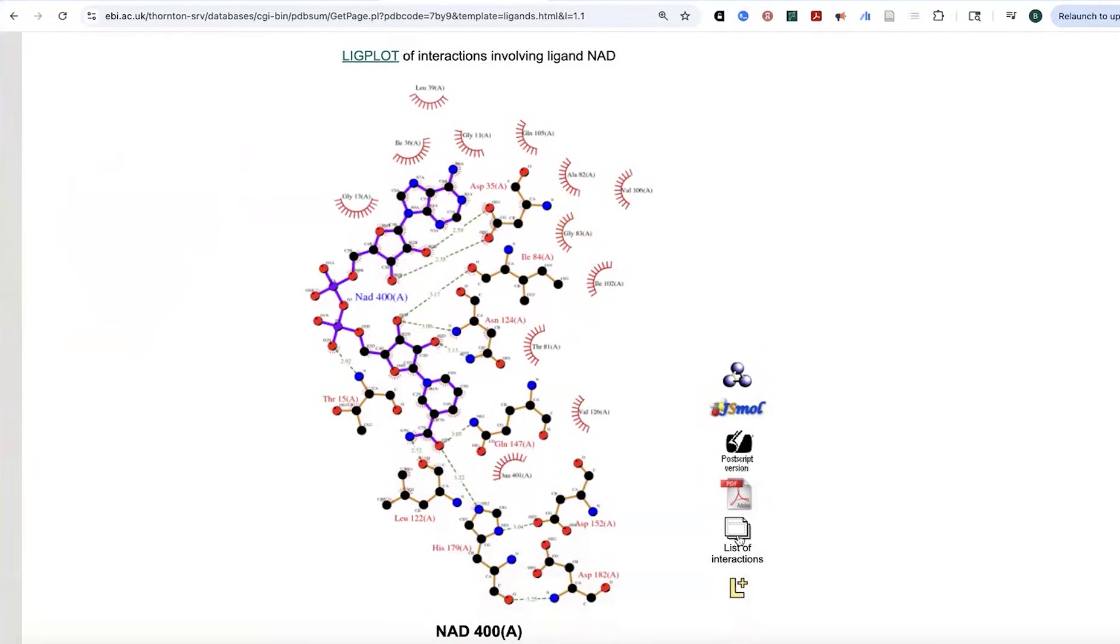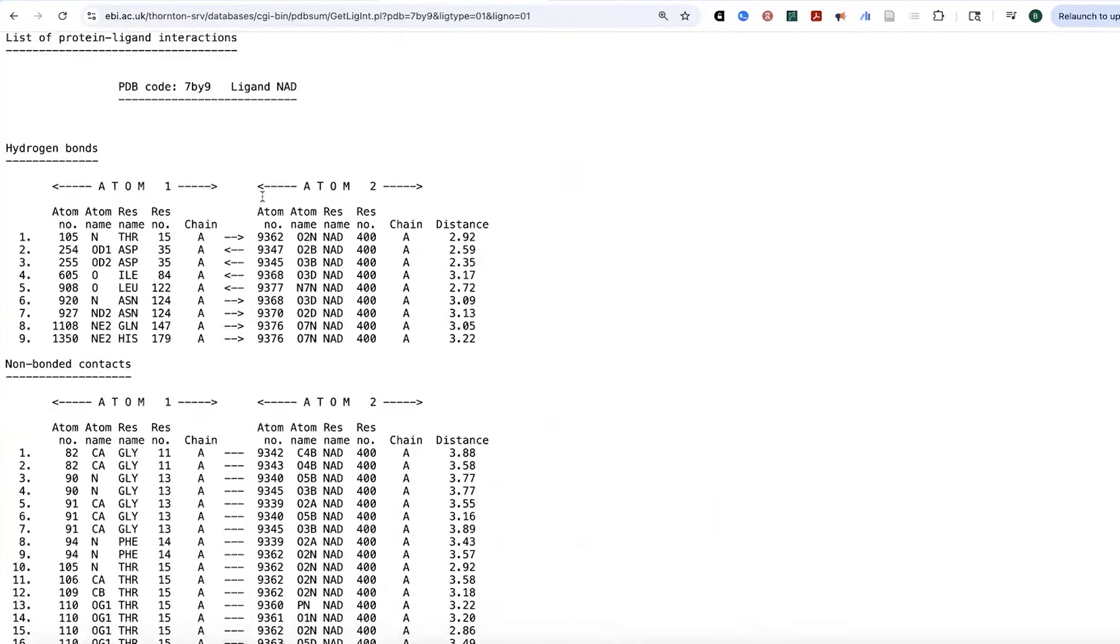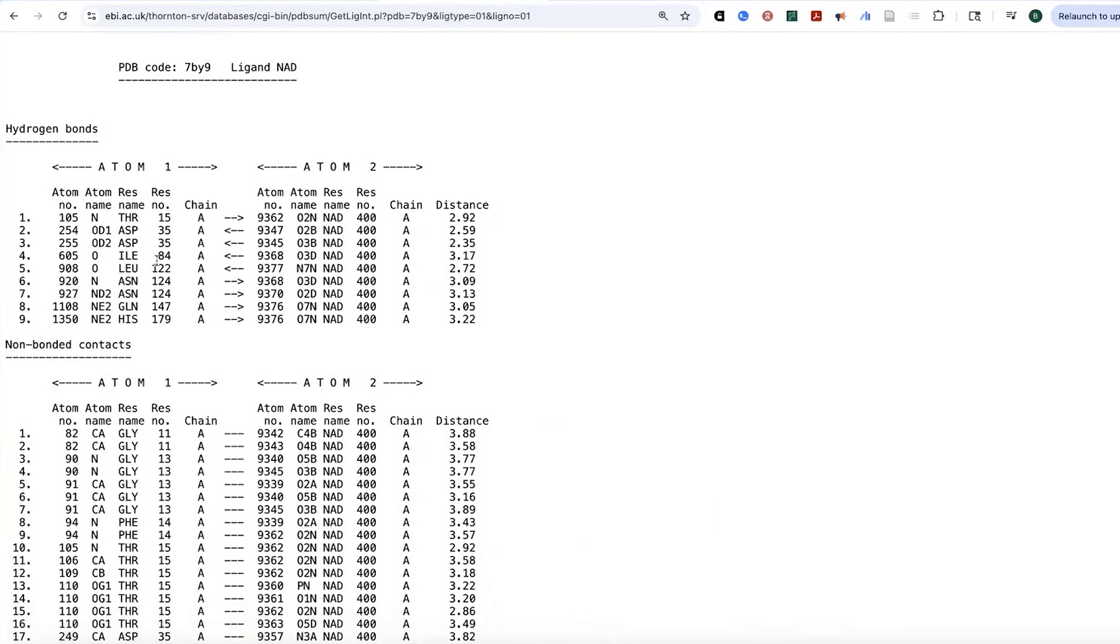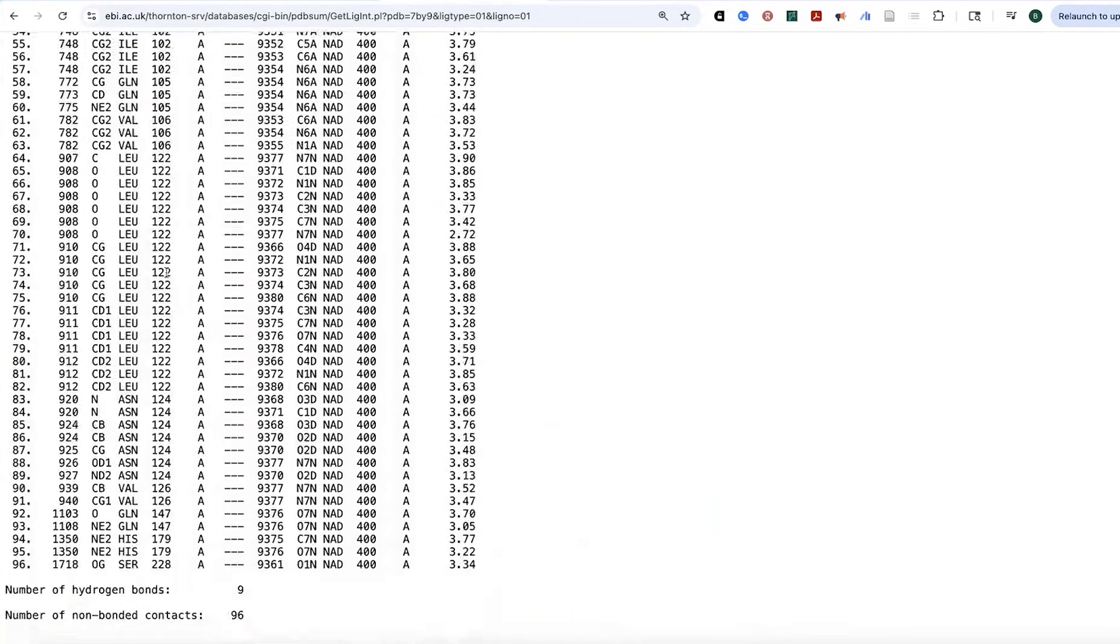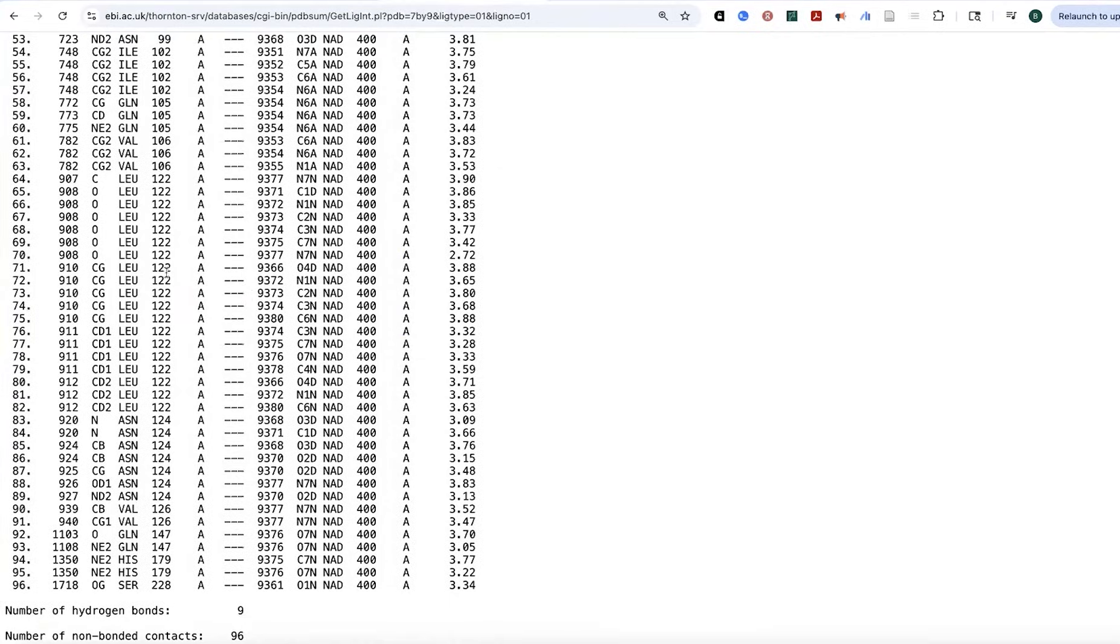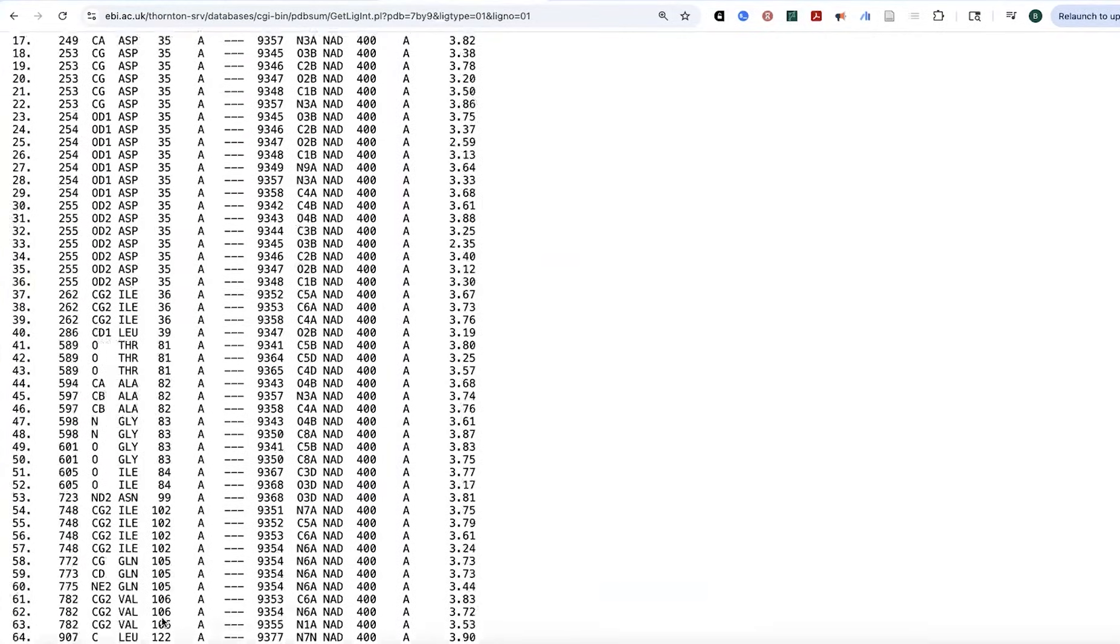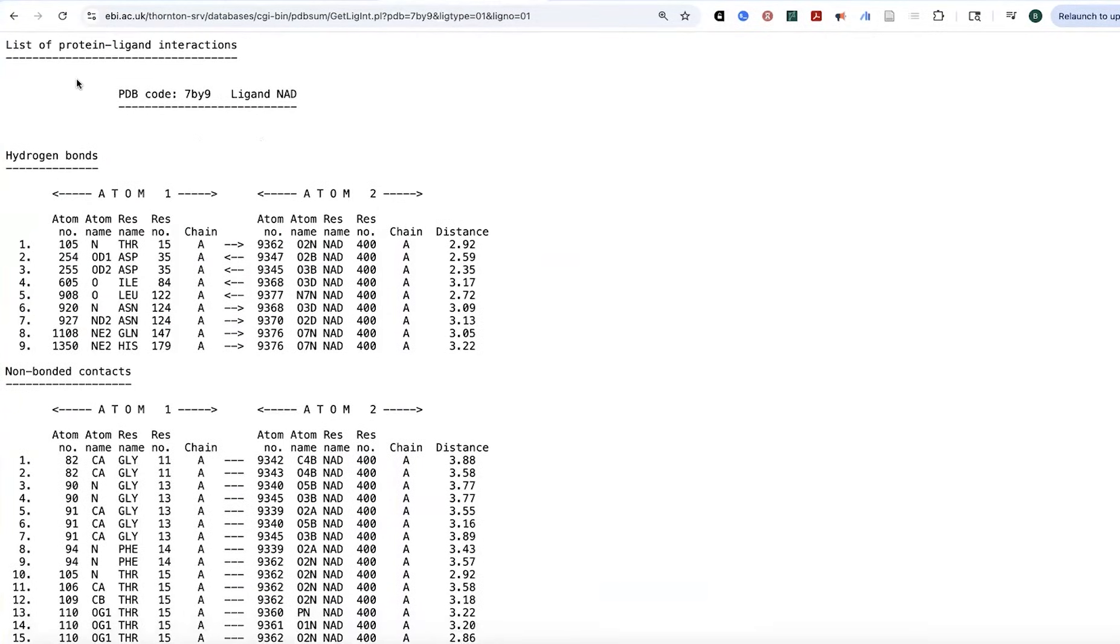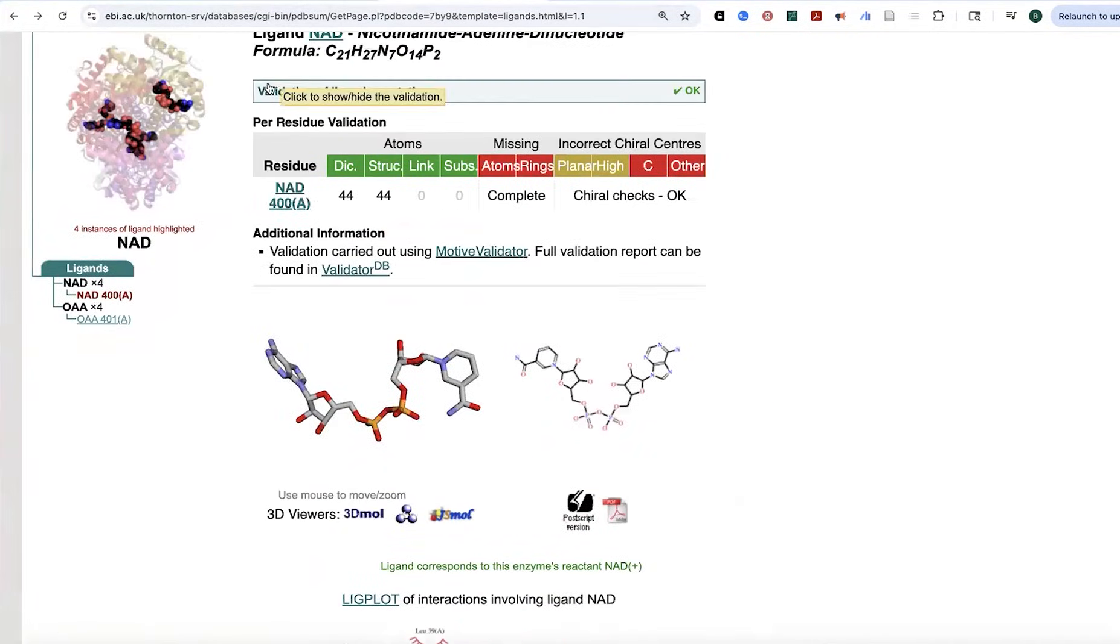If I go to this list of interactions, now I'm going to get those atom to atom distances and I'll see it. It's going to be broken up by the types of contacts. So hydrogen bonds, non-bonded contacts, et cetera.